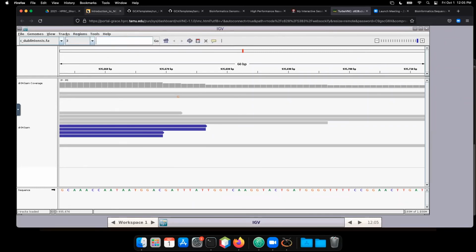But you can just essentially go there, and if you generate a VCF file, which is something we're about to go over, it's a variant call file, and it gives you a position here that has a variant in these samples. So you can go directly to that and inspect and make sure that the variant is real.